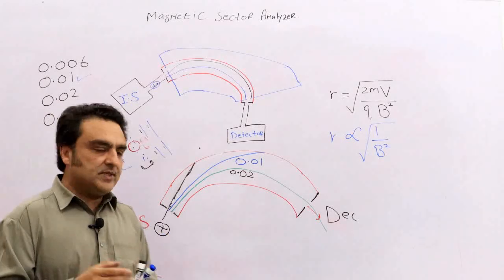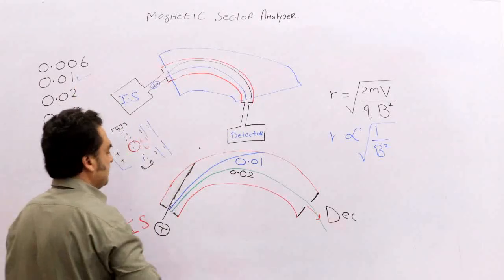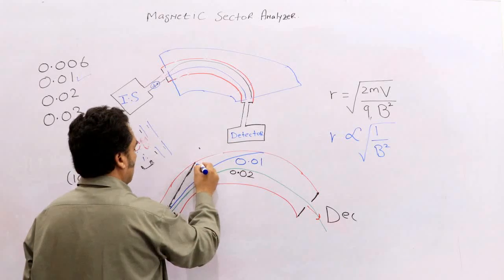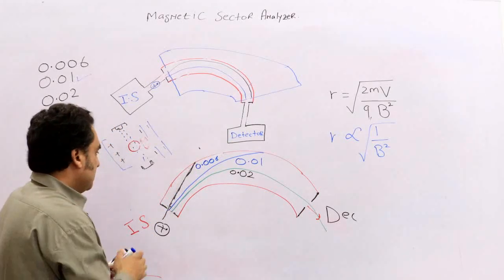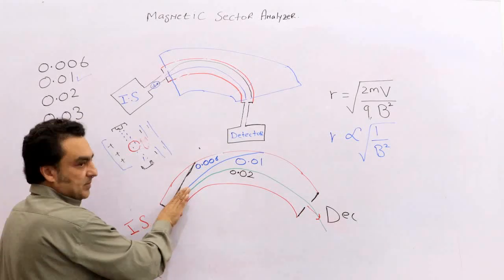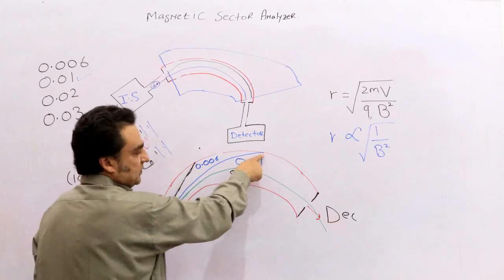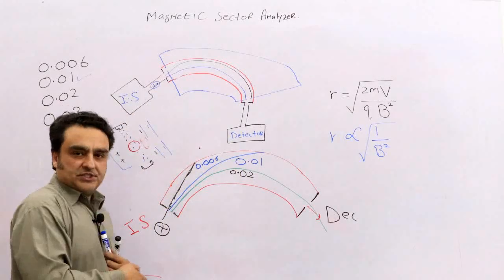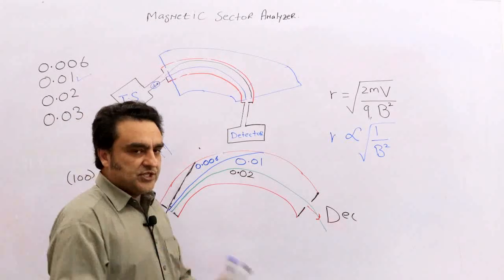You perform three experiments. In the first experiment you used a magnetic field strength of 0.006, very little, and it is destroyed here. But as you increase the magnetic field, now it curves, but again it collides with the wall, and the game is over. You lost, you failed, and you should restart the game.